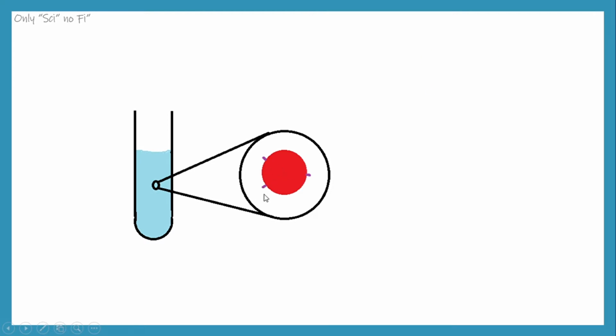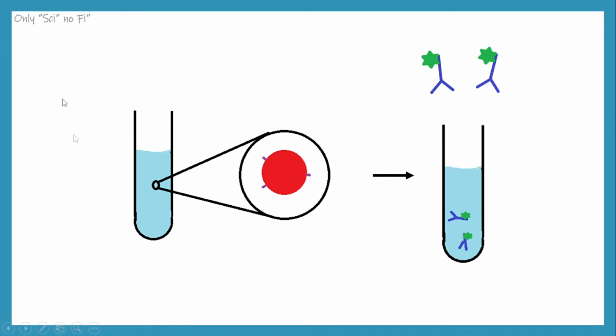What you do is you select a particular antibody which binds to this protein, and this antibody is tagged to a fluorescent label. Now, in this case, it's a green fluorescent tag. So now you take this antibody mixture, that is antibody along with the fluorescent tag, in this particular mixture. Now the cells are going to be attached to these antibodies which have these specific proteins.